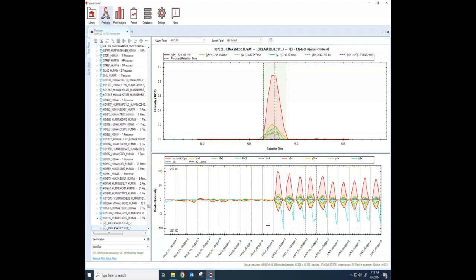But you can be confident here that these signals are real if we see them over and over again across these replicates and then you see that they've completely disappeared in these other sets.